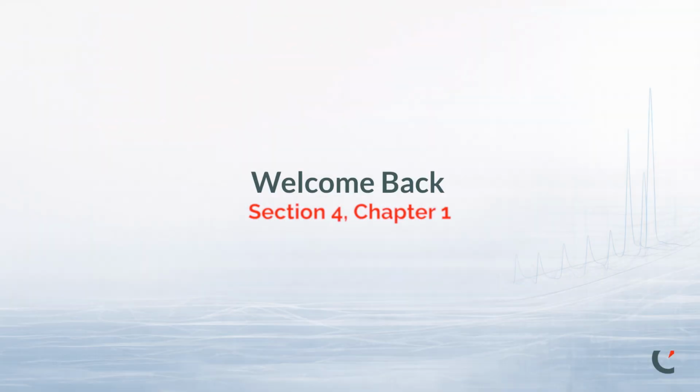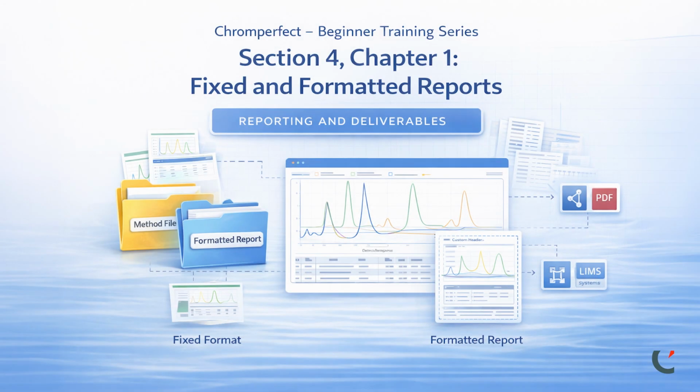Welcome back to the Chromperfect Beginner Training Series. We are about to begin Section 4, where we focus on reporting and deliverables, and how Chromperfect presents analytical results for use outside of the system.